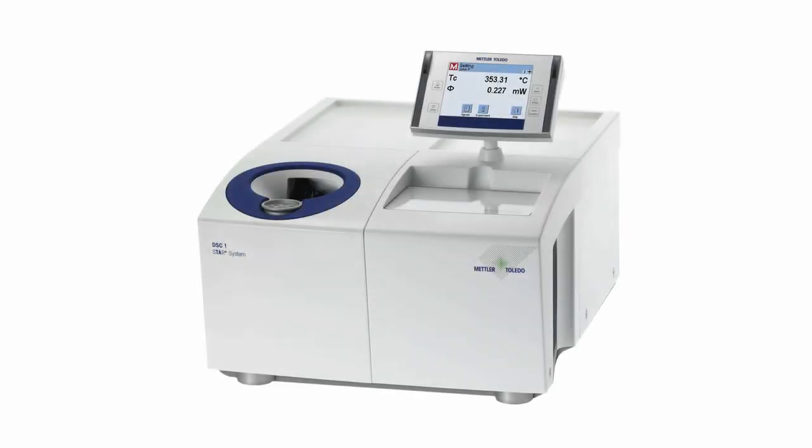In order to achieve accurate results, a DSC has to be regularly calibrated and, if necessary, adjusted.